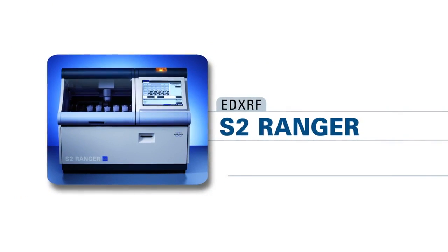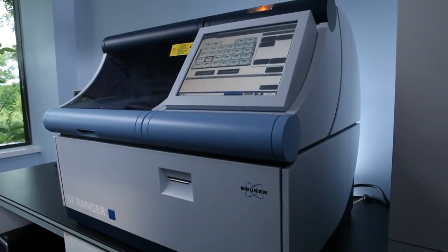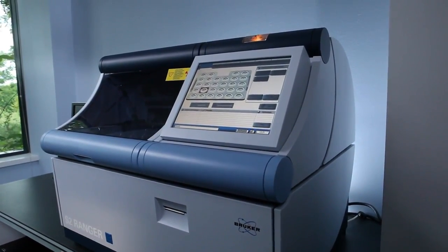The S2 Ranger is Bruker's benchtop Energy Dispersive Spectrometer. It's an all-in-one solution to elemental analysis — essentially a plug-and-play technology. Everything is in the S2 Ranger: from your x-ray tube to your vacuum pump, the computer, and there's even a little printer that can print out your analysis.